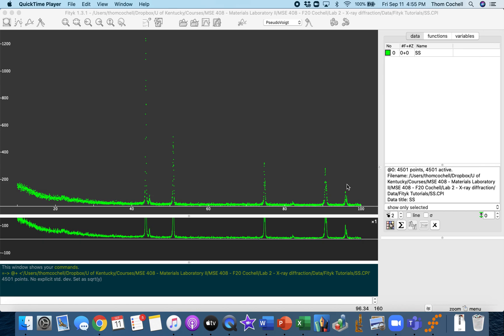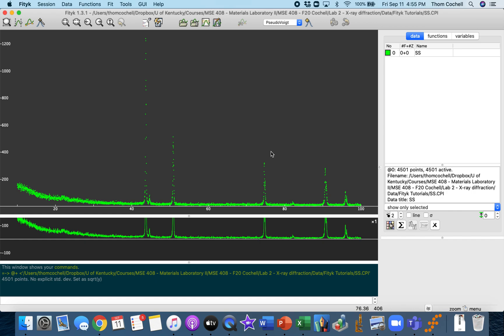So the first thing I want us to do with this data file is just kind of look around and figure out what we can do in this software that could potentially help us.